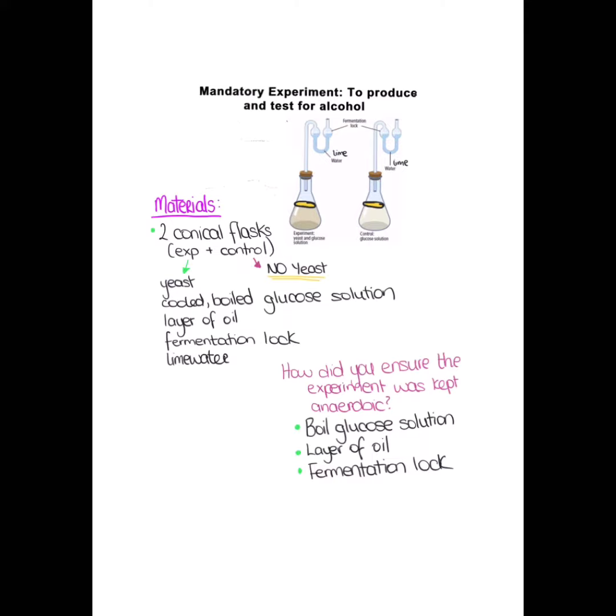In the fermentation lock, we also added lime water. When CO2 reacts with lime water, it turns it milky. This occurs in the test flask only. This is because the control contains no yeast.